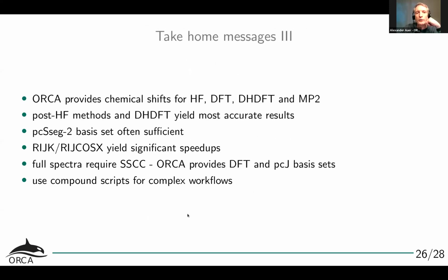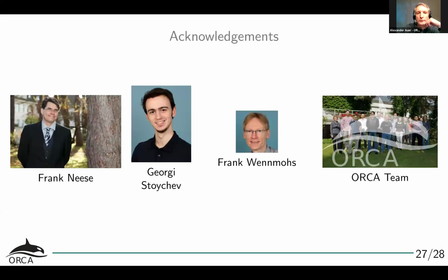So in principle, we have everything here to get shifts and couplings, and if we combine all of this, we can easily simulate the full spectrum, and we can use compound scripts, and whatever the experimentalists give you, you have the opportunity to work on this in ORCA and to provide values that you computed to match structures and spectra. With this, I'm at the end.